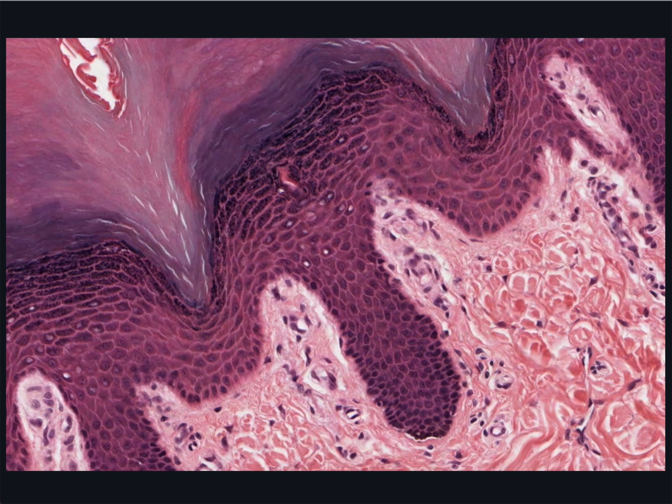Further maturation turns them into a thick layer of keratin. The layers of cells stain bright bluish and red, but are so flattened and tied together by fibres that they form this featureless mass, and eventually flakes of cells are shed from the surface.